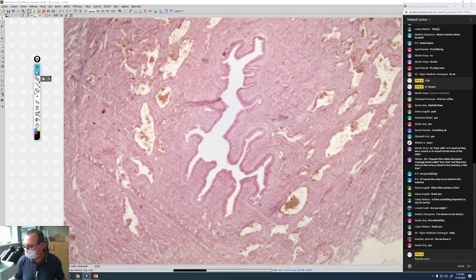I will show with the mouse that this is the urethral lumen, and here is the epithelium. Around is the corpus spongiosum urethrae, where you can find quite big spaces filled with erythrocytes. These are venous cavernous spaces, and we'll describe them in the male reproductive system.